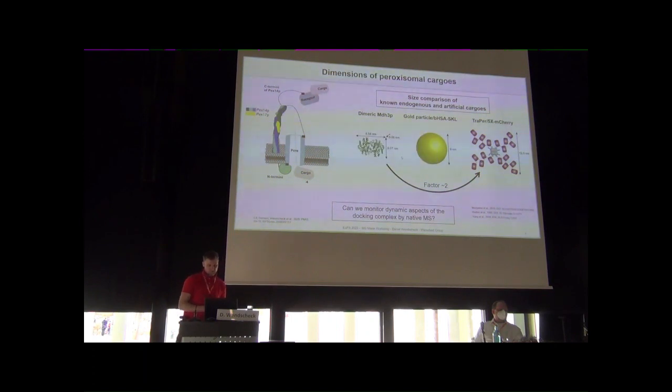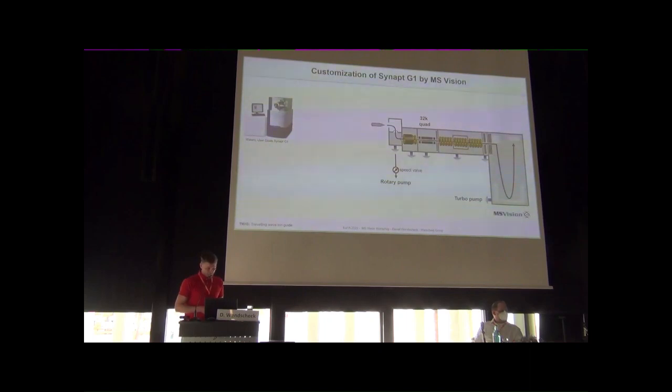The docking complex has to be dynamic, since we have these different sizes of the cargo proteins. For native MS, we are using a Waters Synapt G1 customized by MS Vision, and we have several modifications on this instrument. The first one is an open nano-ESI source, which helped us with thermal control of the nano-ESI source.